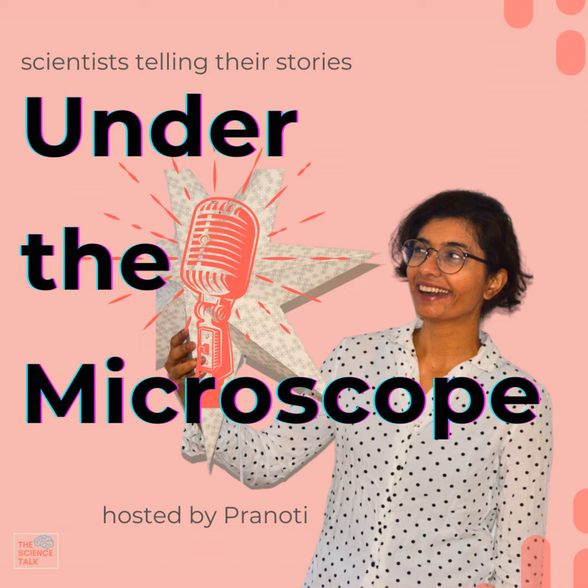Amazing question. So I'm studying ice using the atom probe microscope, not because ice on its own is particularly exciting. Ice is the environment where biological materials live. It's the solution of life, proteins, DNA. And so cryo-TEM is a workflow that allows us to look at things like proteins and DNA using the transmission electron microscope. My current role is to take that idea and apply it to atom probe microscopy so that we can get 3D atomic maps, not of water and ice, but of the proteins, DNA, and other biological materials which natively exist in water/ice.